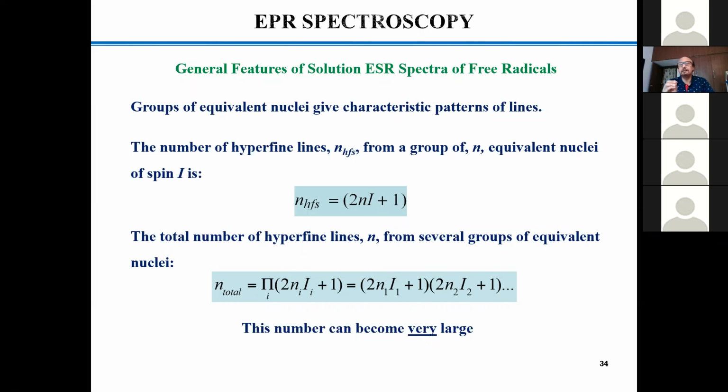what I am trying to say is that in NMR, you have the two-dimensional features, and by which you can understand the things. But in EPR, you do not have that kind of luxury in the beginning. But there are options to handle it.